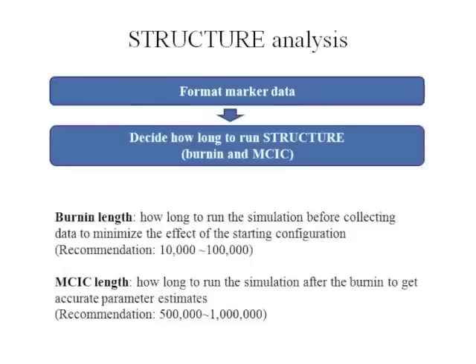The second step is to decide how long to run STRUCTURE by setting the burn-in and MCMC lengths. Burn-in length is how long to run the simulation before collecting the data, to minimize the effect of the starting configuration.